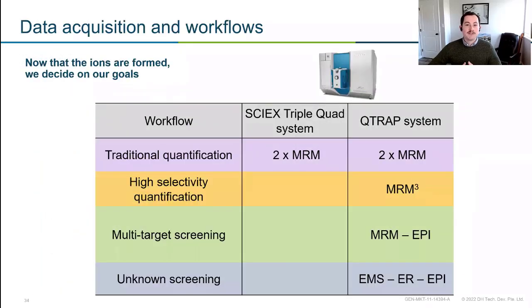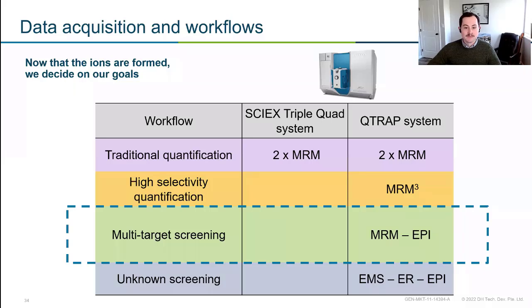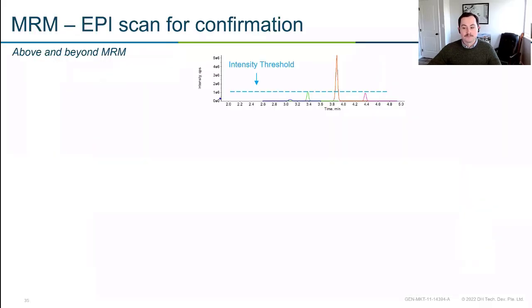But what if you don't want to just do quantitation? What if you want to do qualitative studies and quantitative studies kind of at the same time? And I have a bias. This is my personal favorite workflow with the Q-Trap when we do some multi-targeted screening. So here we're going to do an MRM experiment just like before, except we're going to follow it up with an EPI experiment. And this is called an enhanced product ion experiment. So we're going to be looking at fragmentation, and we're essentially after the compound's fingerprint. So that's what we're trying to get after.